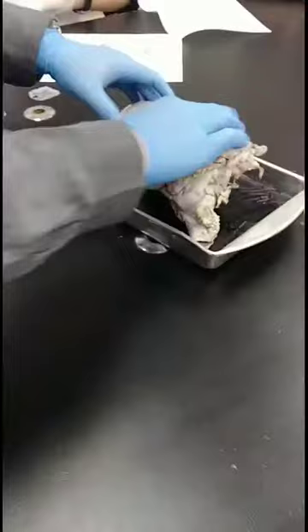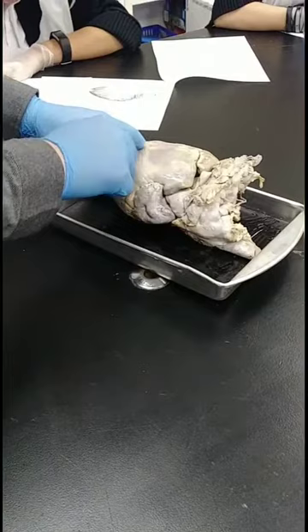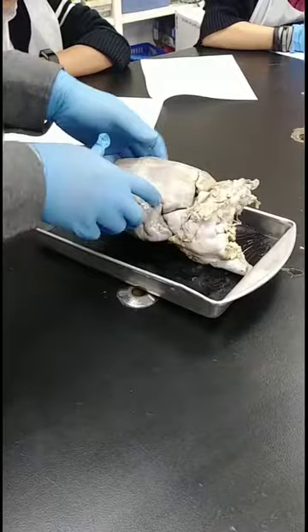Here's the front of the heart, the anterior side. Here's that groove we were talking about the other day, right? The interventricular sulcus, the groove. This is all the left ventricle, and the right ventricle is smaller. You can press on it and feel that there's a chamber in there. It feels a little hollow. On the other side, here's that groove marking the posterior. Does everyone see that?